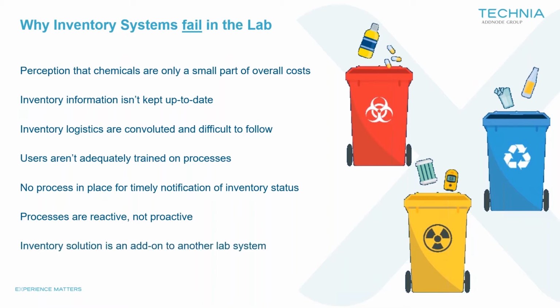And finally, many lab software solutions offer add-on inventory modules. While these may be bundled with another system, they are rarely comprehensive and tend to have limited functionality.